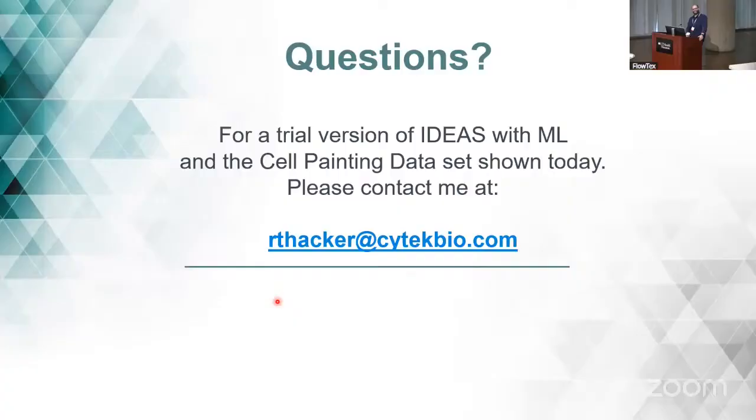I believe that I can use as many as 10 colors with machine learning. Yeah, you could use all the channels. Absolutely. And we have used it actually to pull out some of those immune synapses as well, because sometimes that's challenging just to find them.